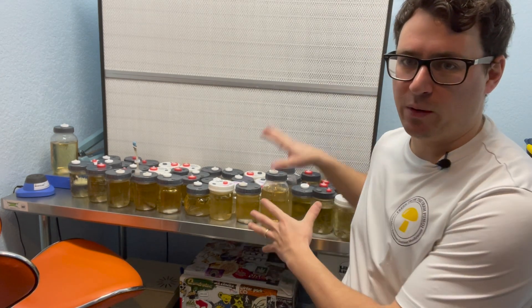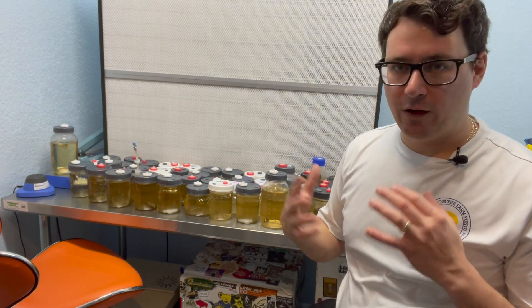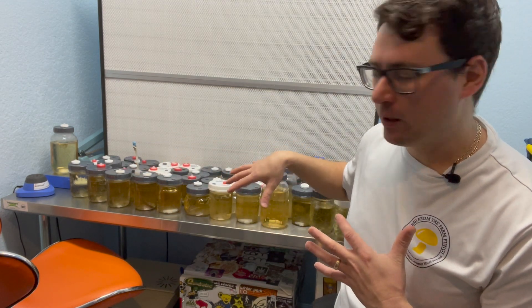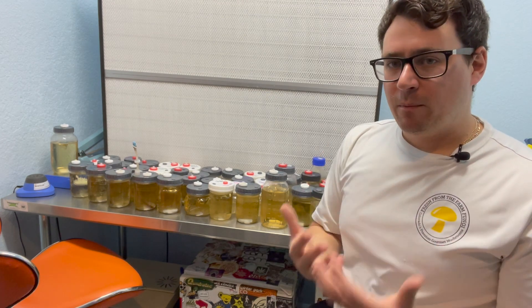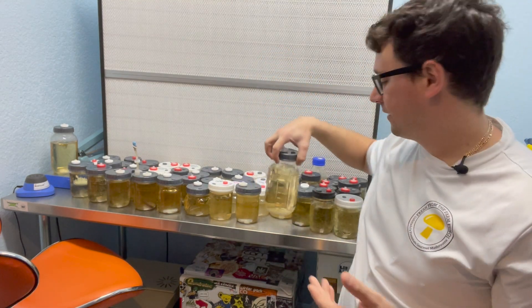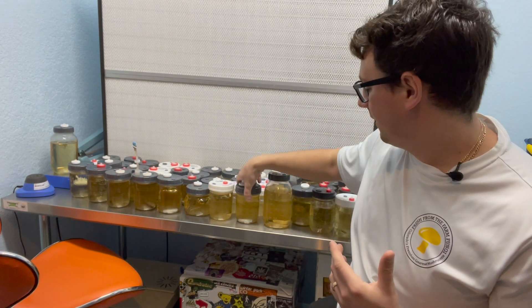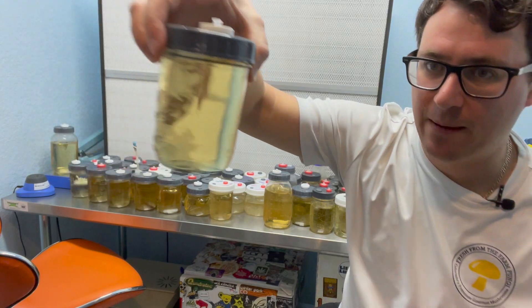So this is a brand new batch of liquid culture that we prepared. We're going to be putting all of these on Etsy. We have about 32 different phenotypes. And one of the most important reasons that we quality control our liquid cultures especially is because it's very hard to tell the difference between mushroom mycelium and any potential contaminants.